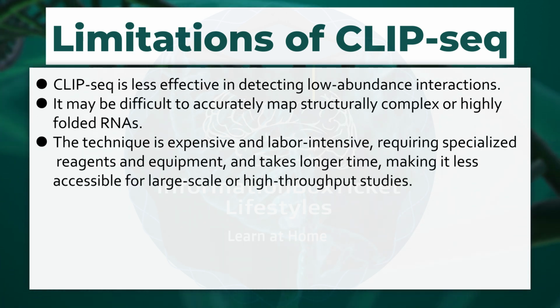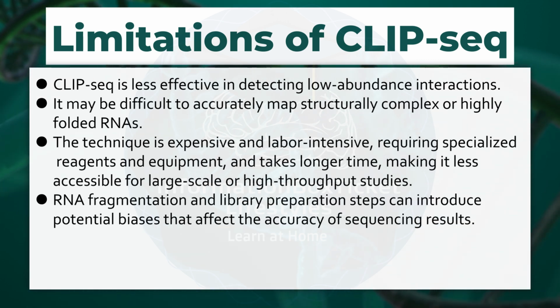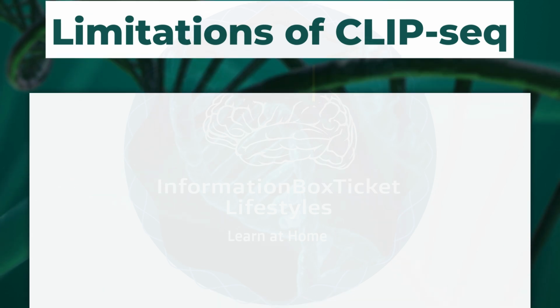The technique is expensive and labor-intensive, requiring specialized reagents and equipment, and takes longer time, making it less accessible for large-scale or high-throughput studies. RNA fragmentation and library preparation steps can introduce potential biases that affect the accuracy of sequencing results.